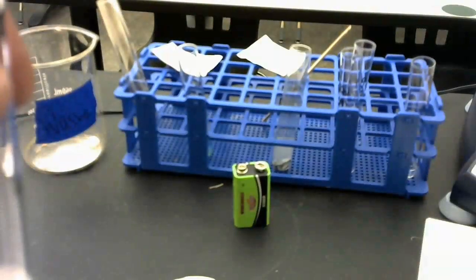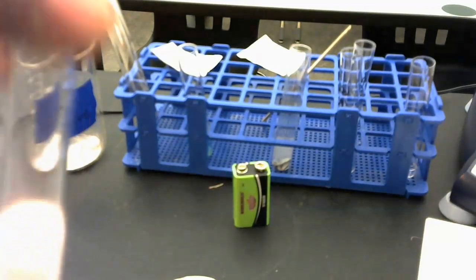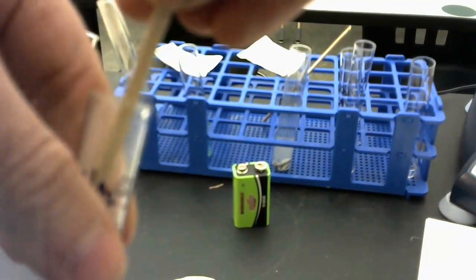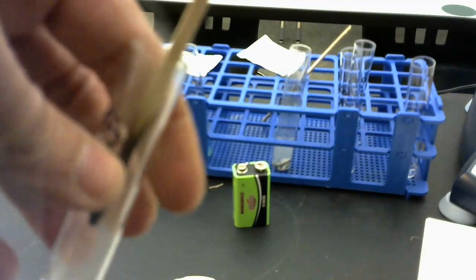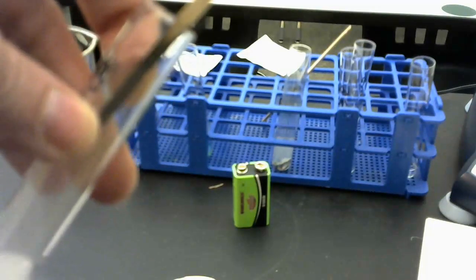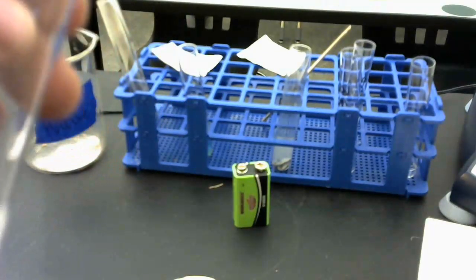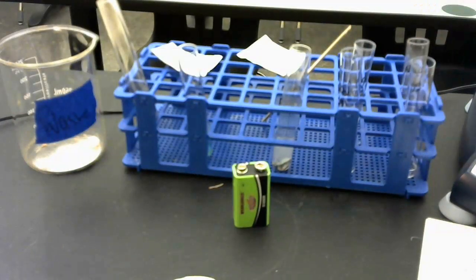And if I heat my burning splint and I put my burning splint in there, I'm going to have that same thick, dense smoke. The splint was put out, and then also it was this thick, dense smoke, just like we had at station number 3. So that again is an indicator that there's carbon dioxide in the air with that kind of reaction.